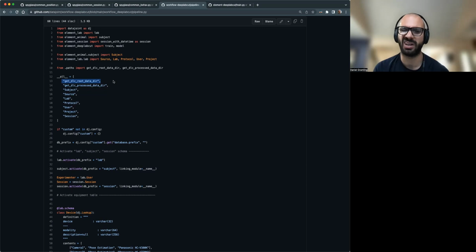Okay. Yeah, I guess just to also clarify, is this more of an ephemeral table, like it exists and then goes away, or is this a permanent thing that would live on our MySQL server and contain all these things in perpetuity? When you're activating it, I'm still unclear on the full functionality of that, but would that bring up a pre-existing table, or would that bring up a fresh instance of these tables?